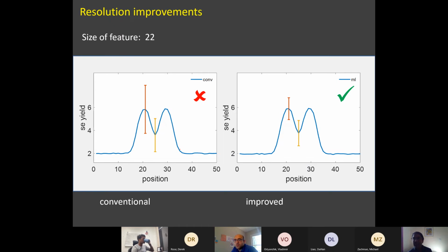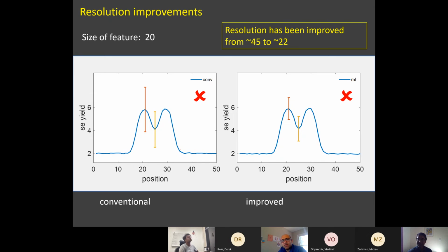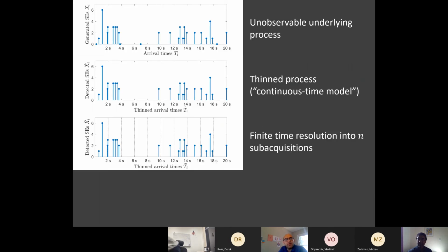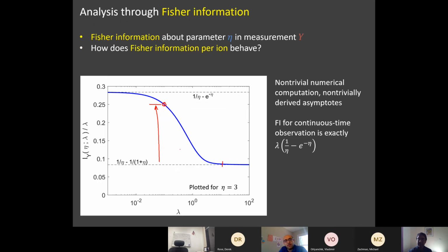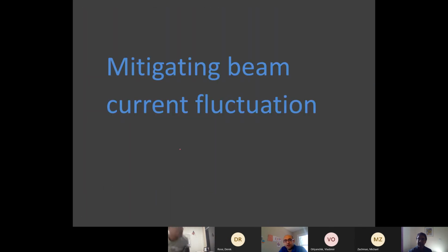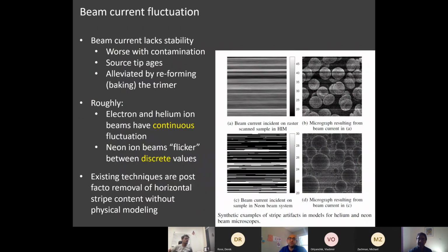Thank you very much. So do we have any other questions? I think we don't have any other questions. So for me, other than helium ion FIB, where else do you see application for this? Because we have tried previously the SEM, at least some of them, and you mentioned there are problems with the SEM for this application. Where else can you apply this?